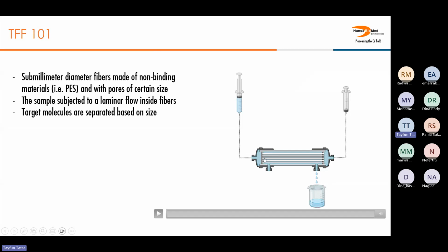Basically, these filters have Luer lock connections at the ends, so they can be connected to any Luer lock syringe. The syringe is not a consumable of the filter. It can be these regular syringes, 20 ml, 15 ml, larger or smaller ones, whatever comes with a Luer lock connection.